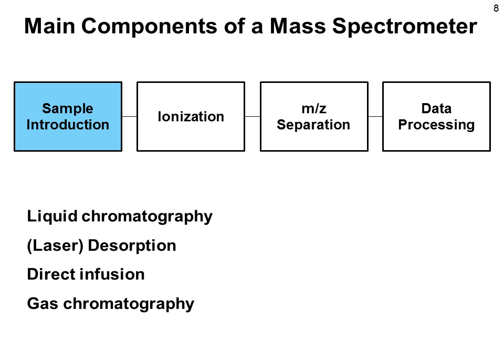That's why most of these molecules to date are analyzed by liquid chromatography mass spectrometry rather than gas chromatography mass spectrometry. However, there are quite a few molecules, for example in the petroleum industry as we heard about, but also others that are very suitable for gas chromatography mass spectrometry, and this is then also the method of choice.